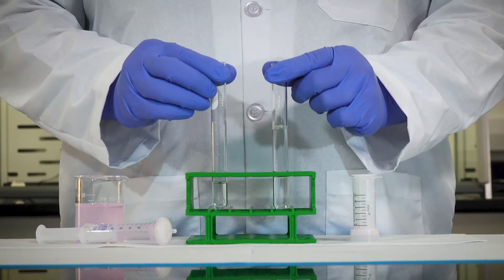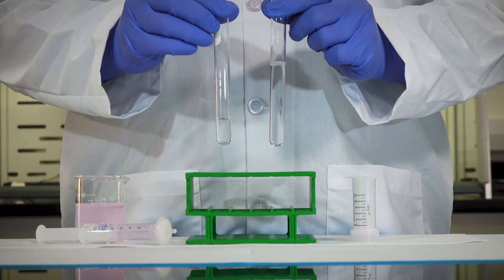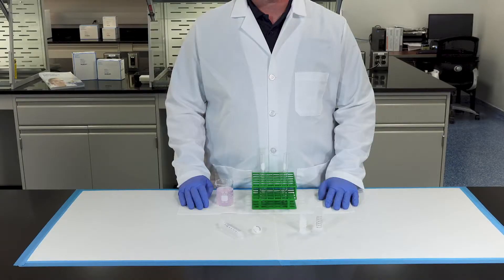Both devices will produce a filtered sample ready for your next step in your process. Let's focus on what's the difference between these two designs.